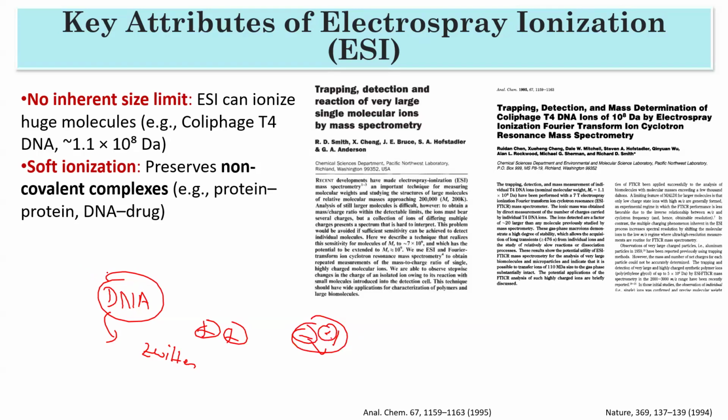So we don't need to care about what charge it has. What we need to see is whether it is ionized or not, like whether it has excess charge. If it has excess charge, then you can analyze it by the mass analyzer. But if it is neutral, with overall charge zero, then you have to first ionize it.